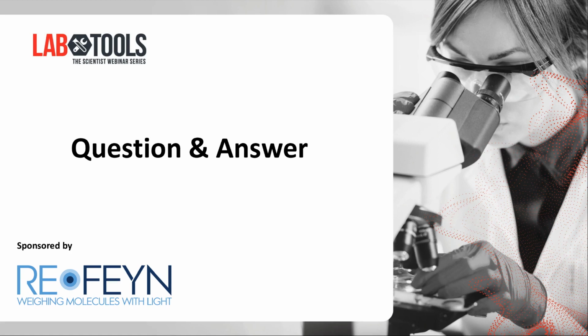Great, thank you. And now we have time for just one more question. How do you determine MinD monomers in the solution, since it seems like their size may be close to the lower mass detection limit of the technique, depending on background noise?